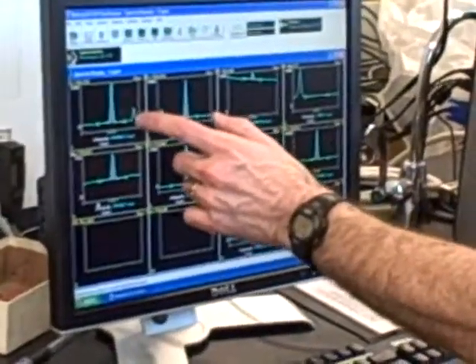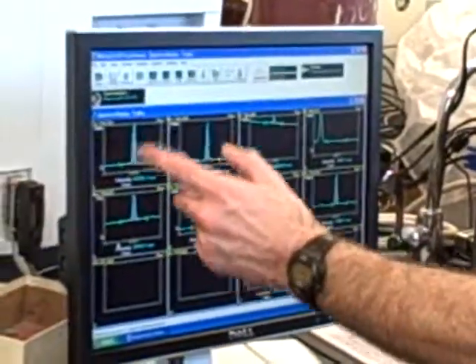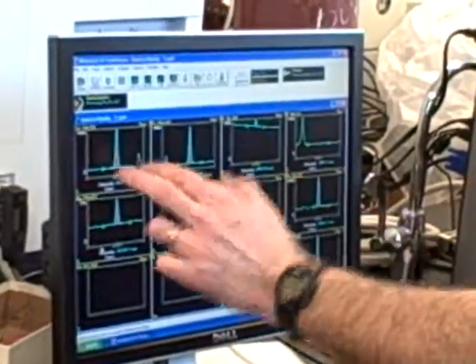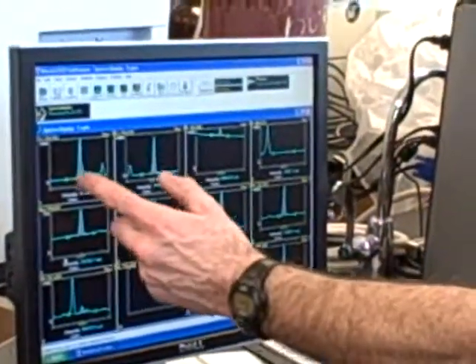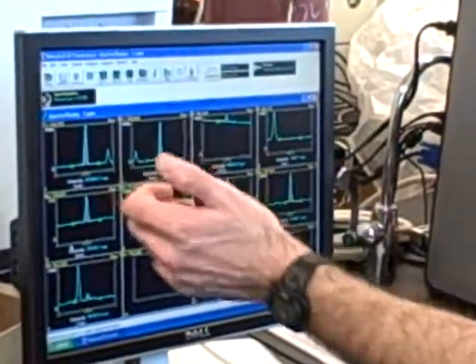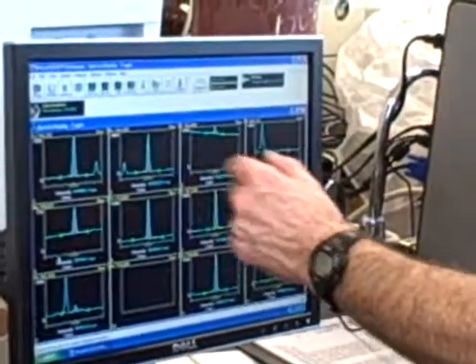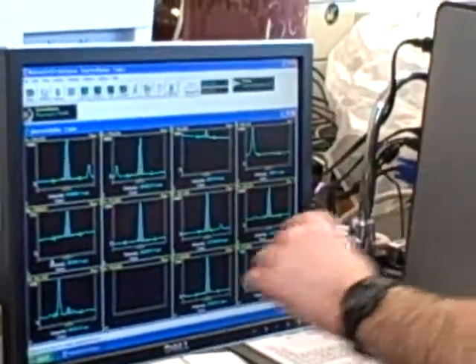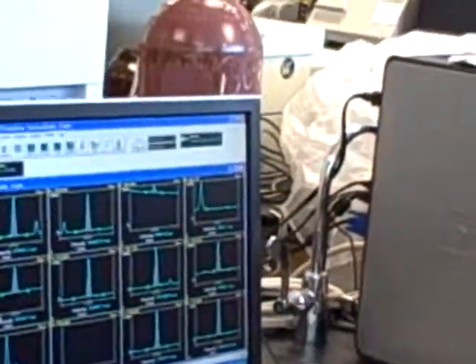What you'll see here is an emission line of something else, and I don't know what it is. It could be any element. This is the emission line specifically of copper, but they're resolved, they're separated. So as long as they're separated, we just focus specifically in this case on the copper, and we can quantitate from there. This one's at 259 point something for iron, for potassium, magnesium, zinc, chromium, whatever. That's just what's in this method.